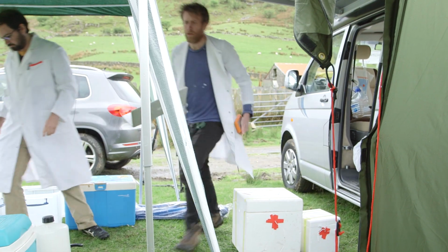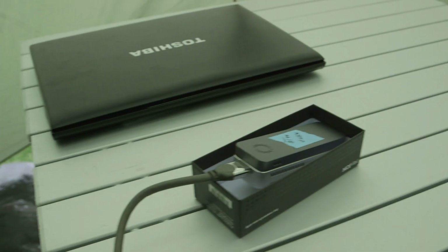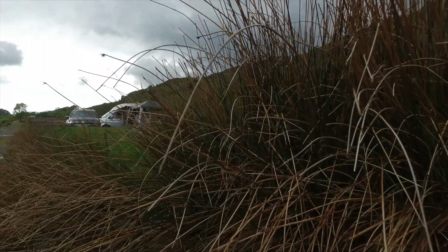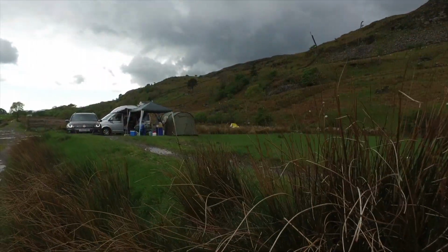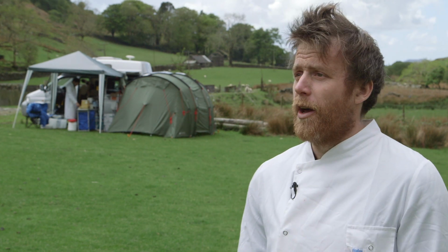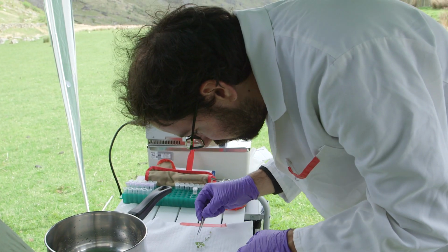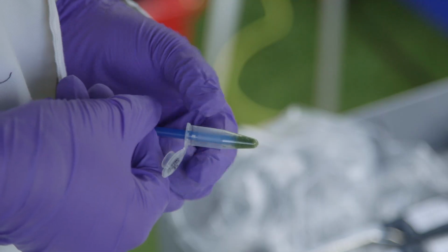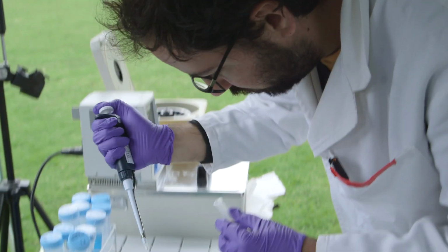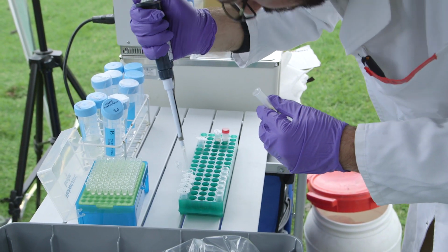Up until now, the problem has been that DNA sequencers are massive. They're about the size of a fridge. They have to stay in a lab, which has to be carefully controlled, climate controlled, power controlled, all the rest of it. It's pretty inconvenient, because what we want to do is come to places like this and actually read the DNA of things in situ. And if we do that, we can hopefully work a lot more quickly, find out more interesting things, work with species that can't be moved out of country for one reason or another.